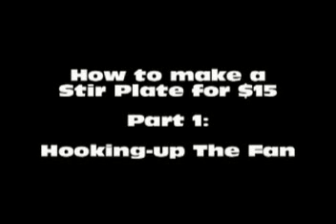We're going to talk about how to make a stir plate for about $15. I got a fan for $3 and a power supply for $3, so there's $6 right there.